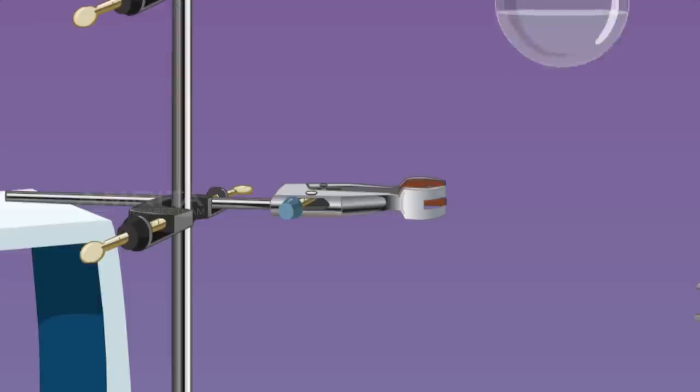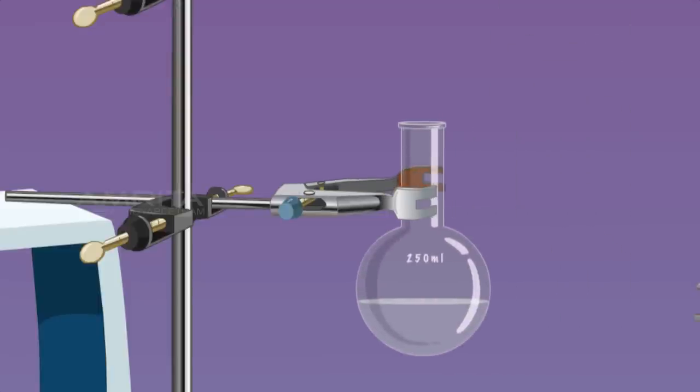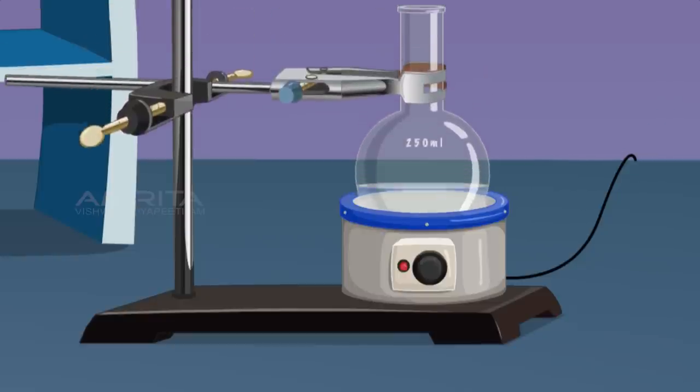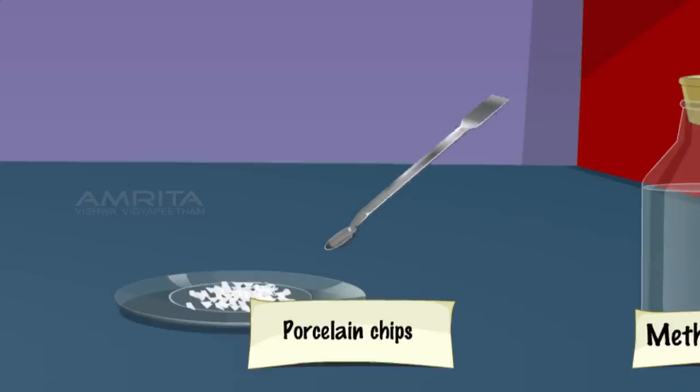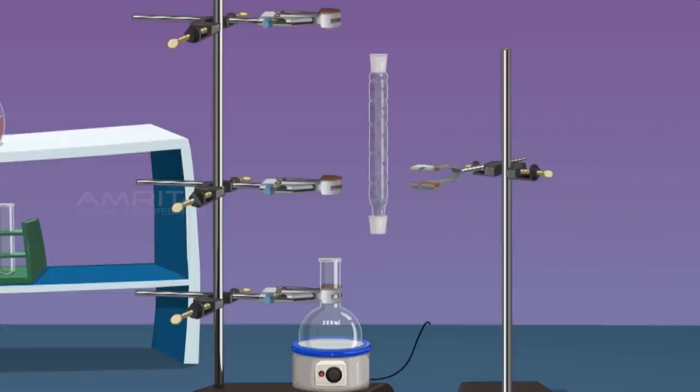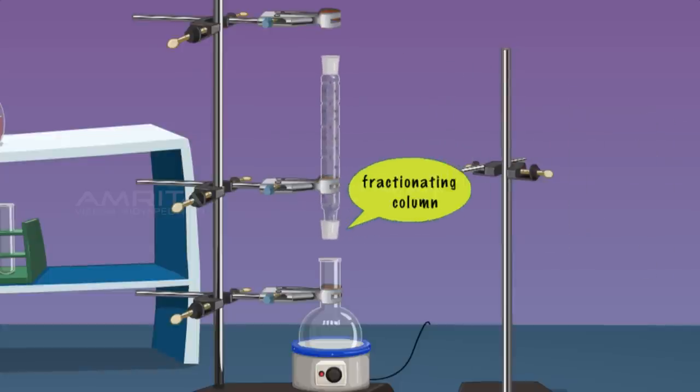Clamp the RB flask to a stand and place it in a heating mantle. Take some porcelain chips using a spatula and put them into the RB flask to avoid bumping while boiling. Connect a fractionating column to the RB flask.